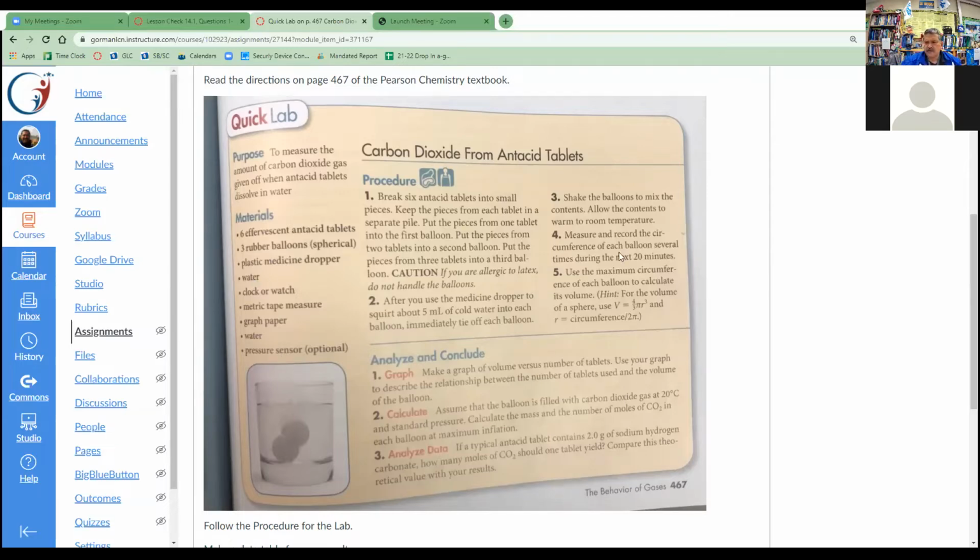And I'm not going to use a pressure sensor. Okay, so I think I've got everything I need. Because I'm in my science classroom, I also grabbed a mortar and pestle. This is used for crushing stuff, and you don't have to have one of these. You could just use a hammer, or anything hard on the floor or on a desk. That would all work just fine.